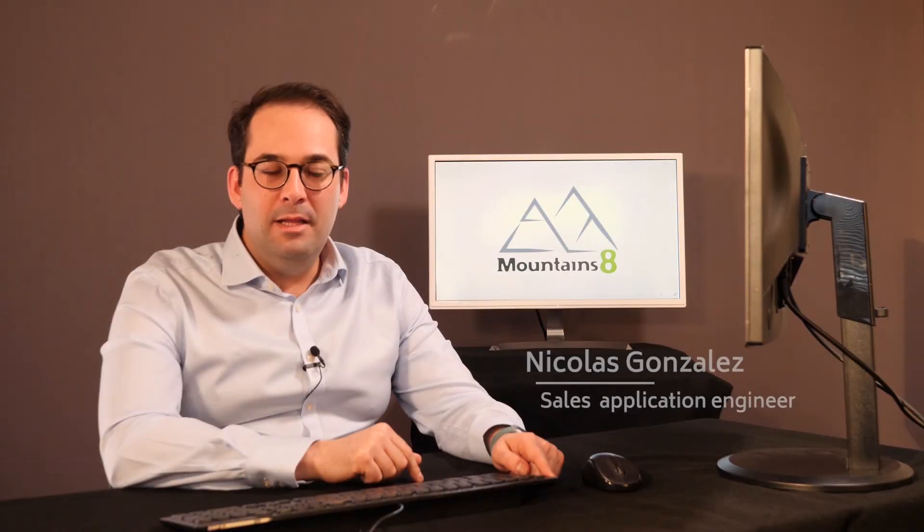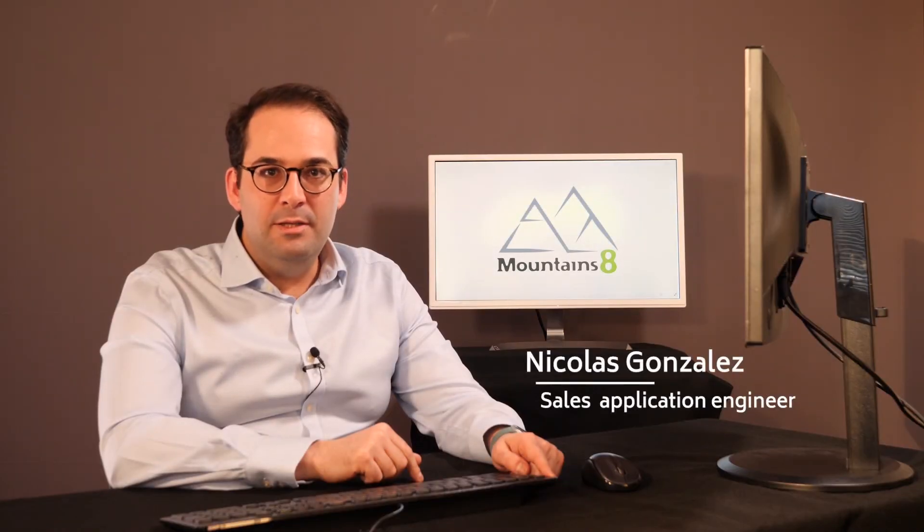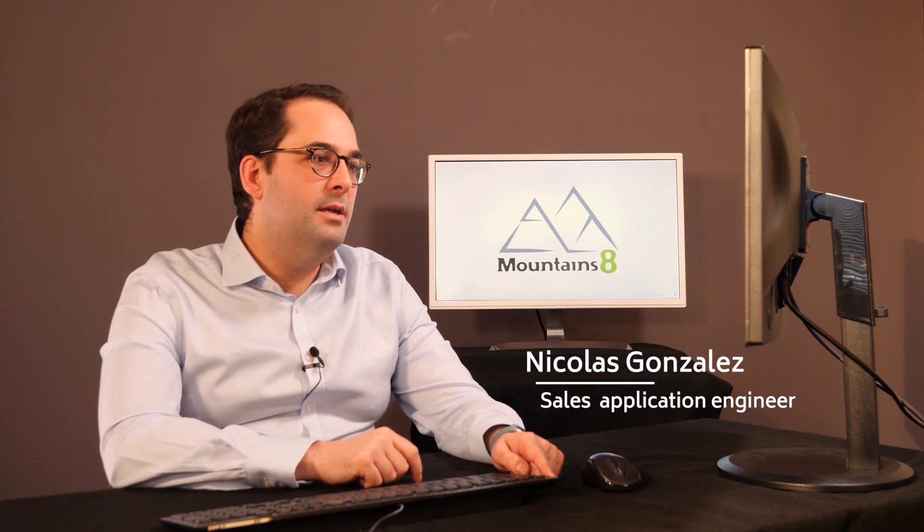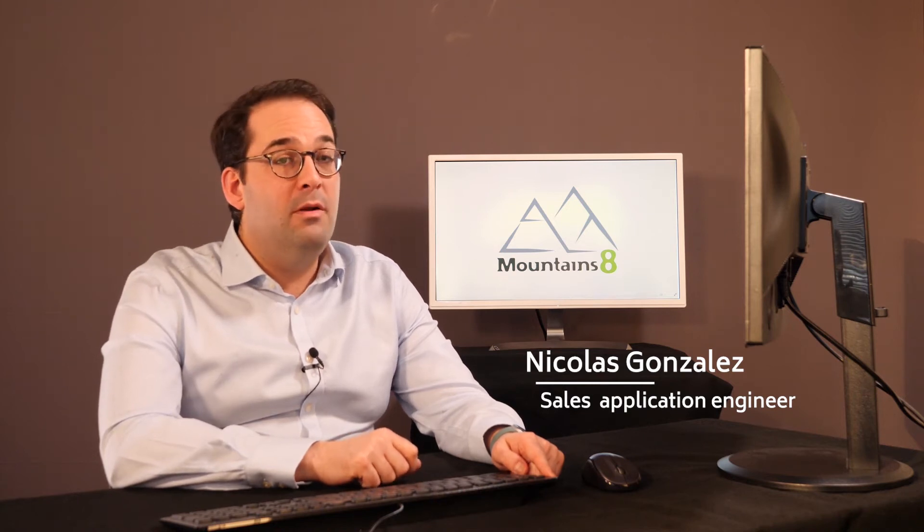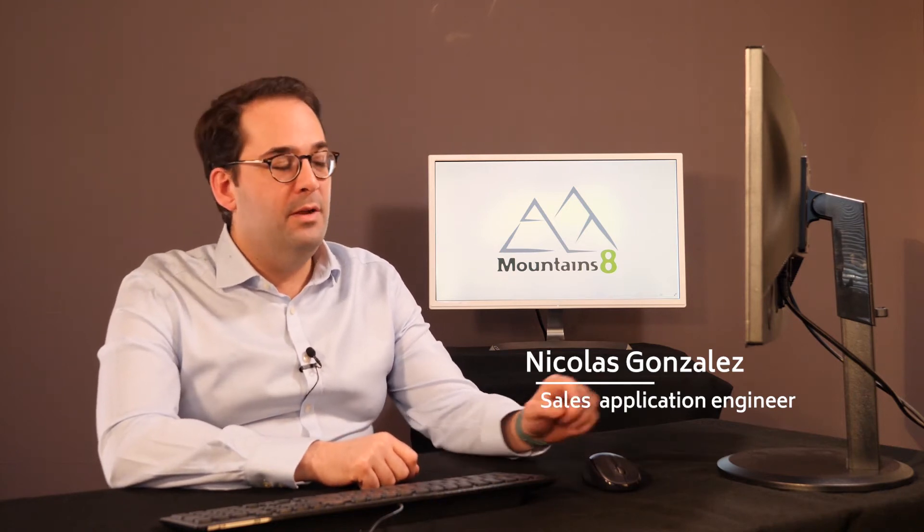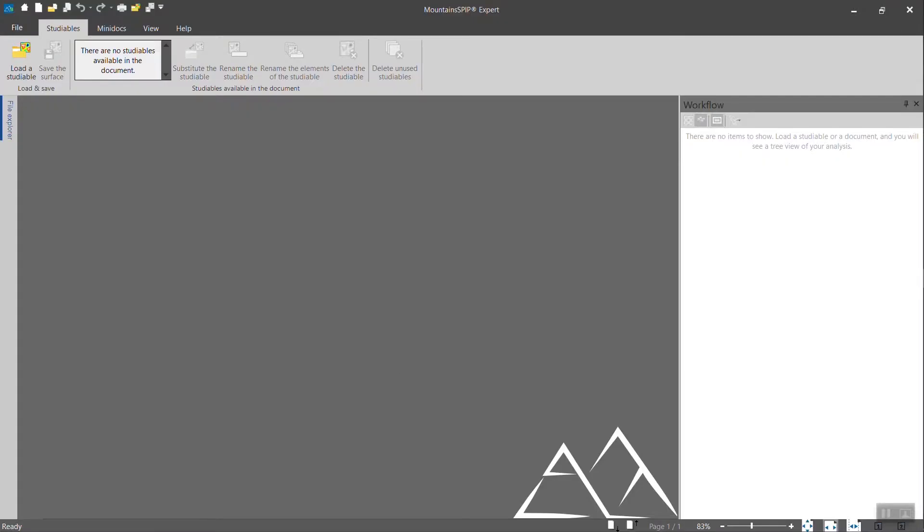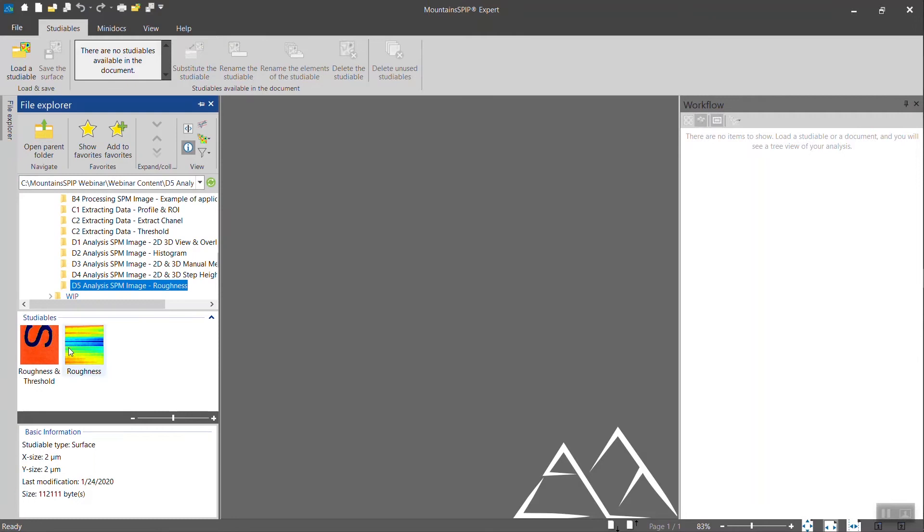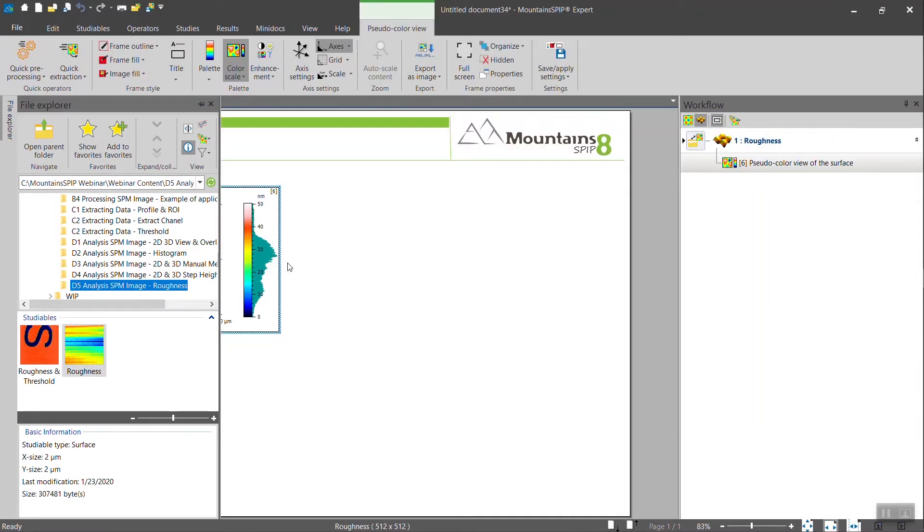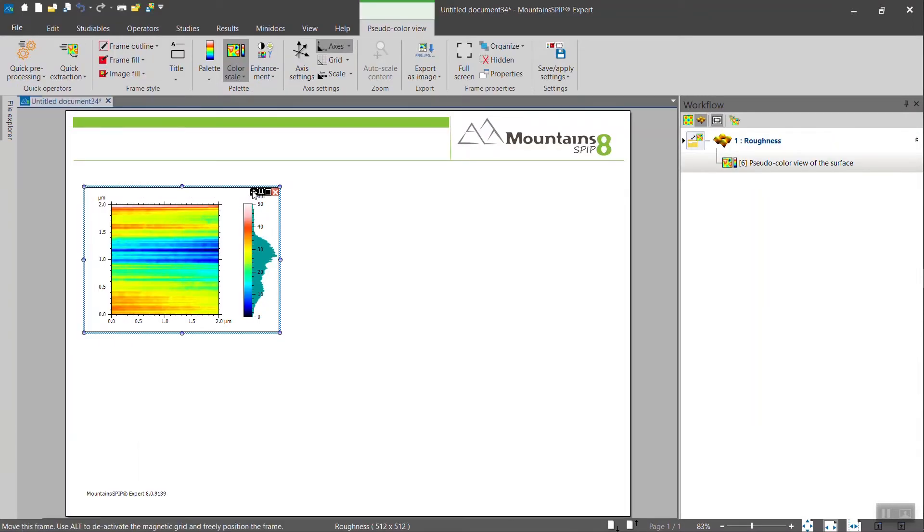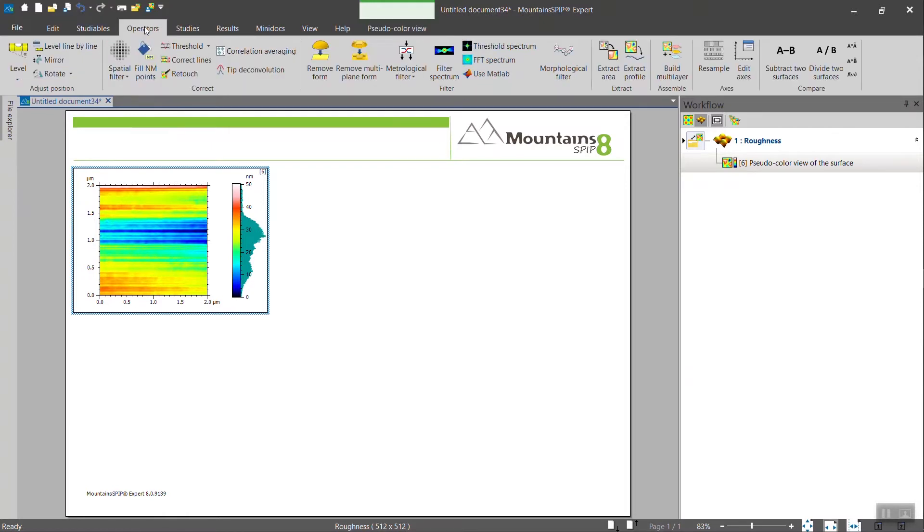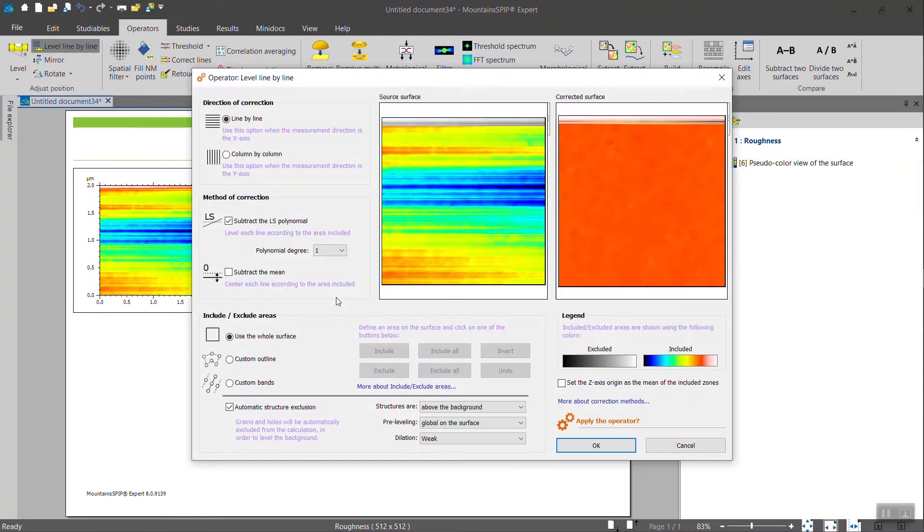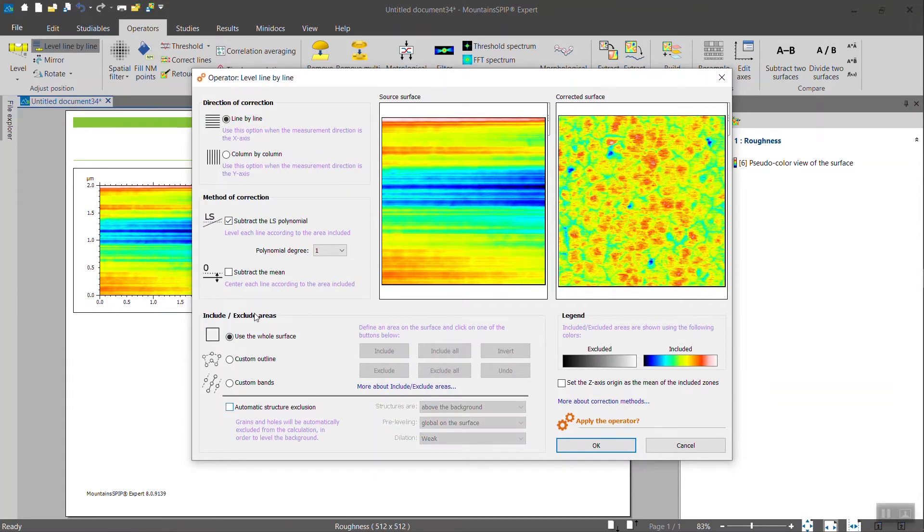The last study that we wanted to present you today is how to calculate roughness values. We will start with this AFM data, which we will first prepare for analysis, like that, for instance.